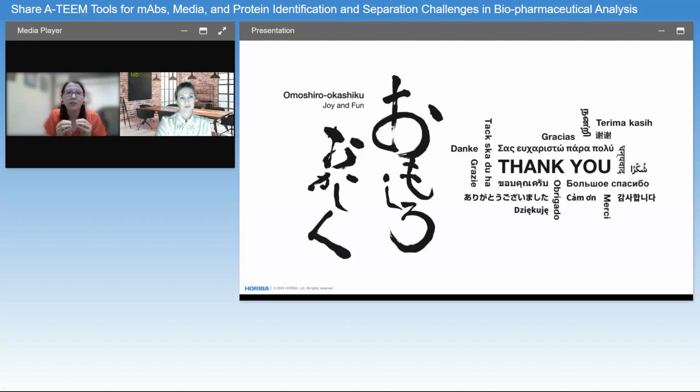That library should capture the variations that you may have in the complex mixtures that you specifically are looking at for your application. And the reason I say this is because fluorescence, tryptophan fluorescence will change with the local structure, the local solvent environment. The peak will change, the intensity will change with concentration, the width will change as well. And so you can have a library entry for tryptophan, but based on the local environment, especially in these complex type protein mixtures, you would have to have an entry for everything that you do know.